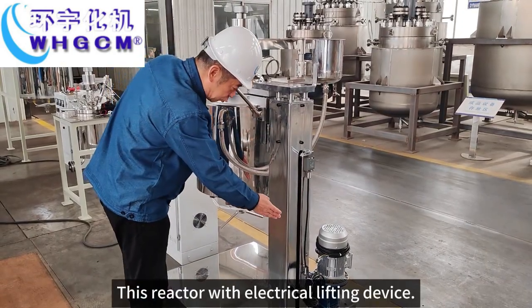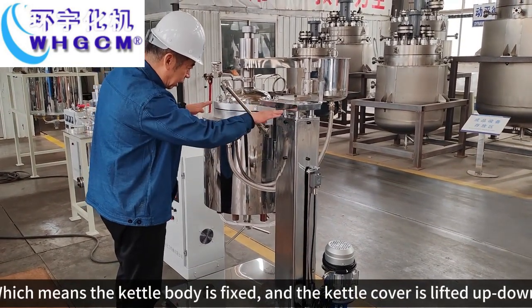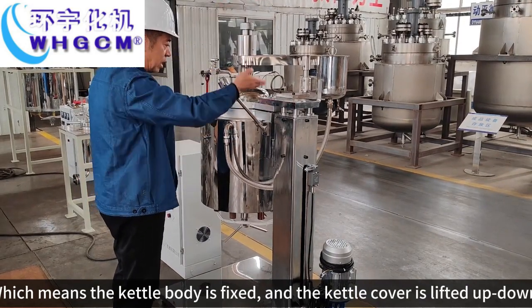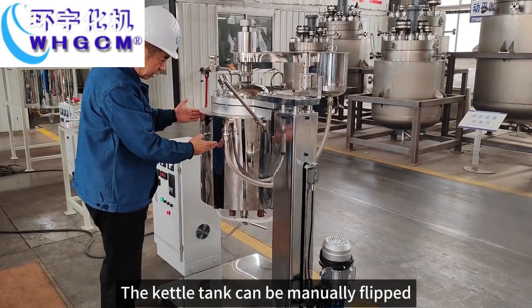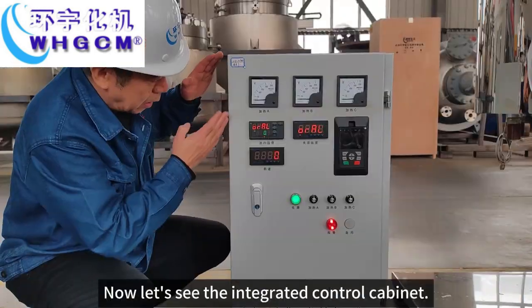This reactor has an electrical lifting device, which means the kettle body is fixed and the kettle cover is lifted up and down. The kettle tank can be manually flipped.